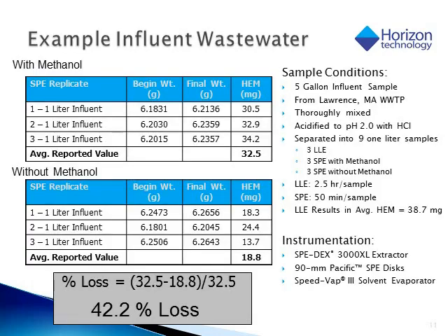As an example, Horizon Technology took and extracted a set of samples from our local wastewater treatment plant, one set with methanol and one without. What we found is that there was a 42% loss in analyte recoveries when methanol wasn't used.